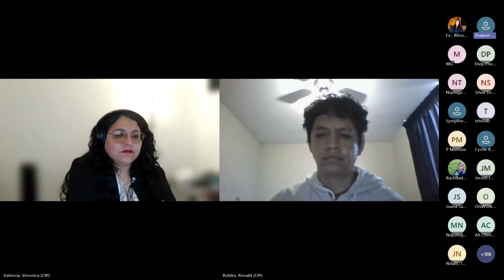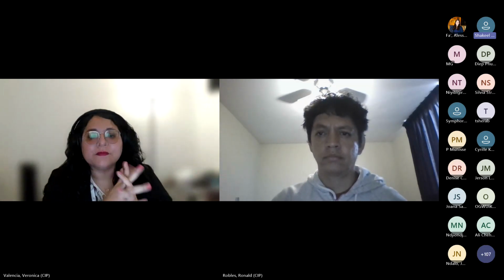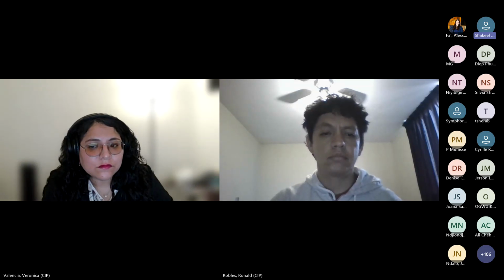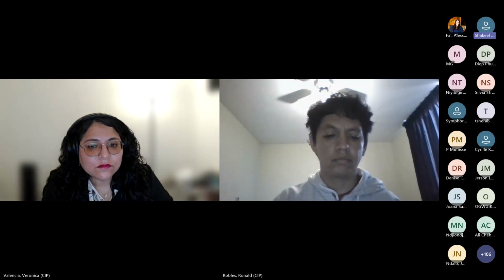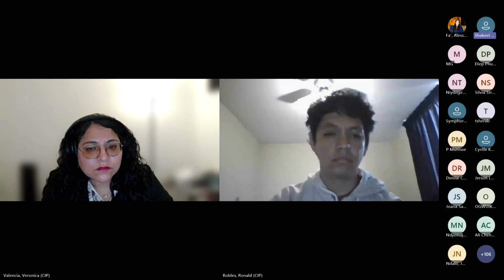First of all, thank you very much for such wonderful presentations and such rich content. I have a couple of questions. Though it's very basic molecular biology experimentation, for my own understanding, do you think there is any optimum ratio, as we all agreed that liquid nitrogen is the best way to grind the tissues to lyse the cell.